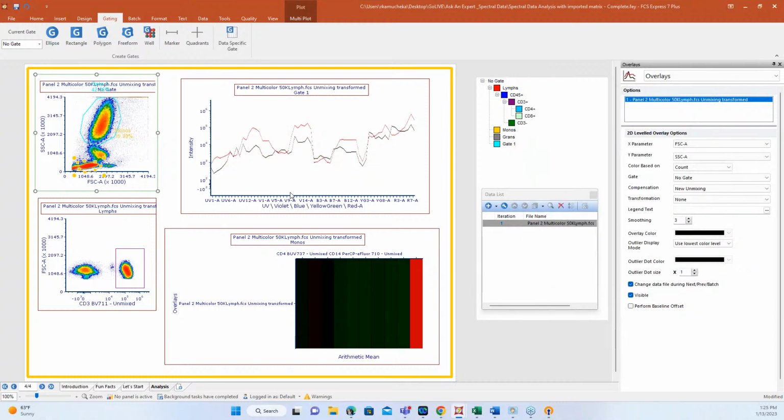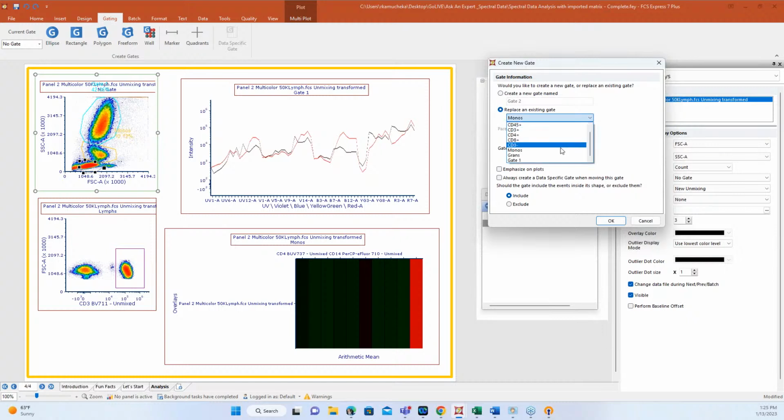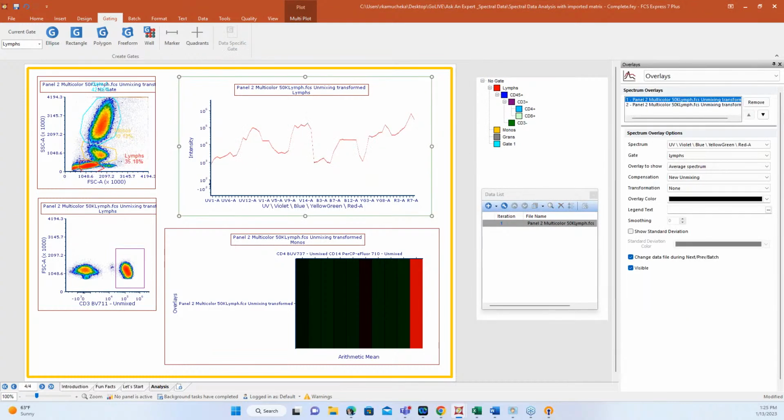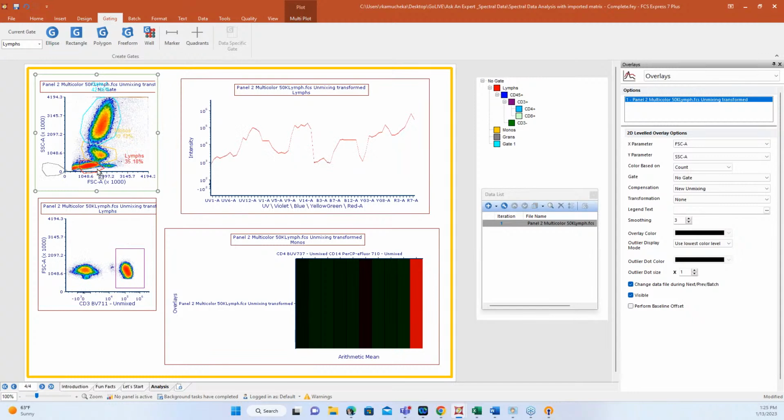So you really can think about it as just the same kind of flow data you're used to working with. And then next is, how do I take advantage of these spectral tools that we do have? Getting to those plots, kind of what you're doing right there with the overlay, and really using those tools to show things in a different way. So you can always do either or, right? Or both if you want to. If you don't want to mess with spectral plots, you don't have to, and you just analyze your data the way you would non-spectral data. But you can also add these spectral elements as an enhancement to what you're already doing.